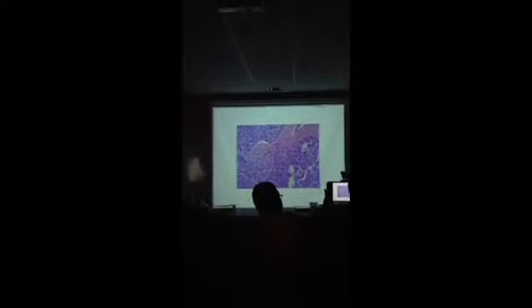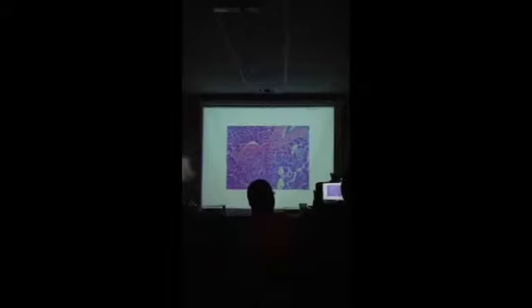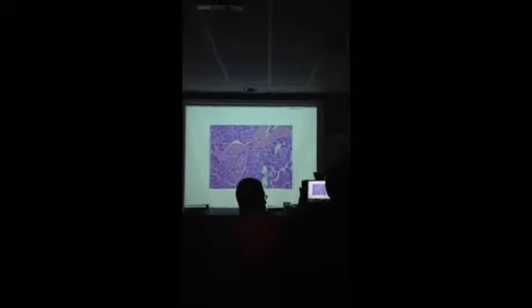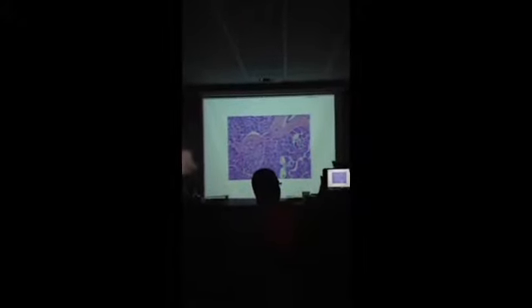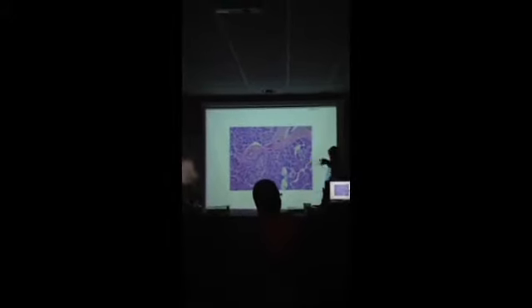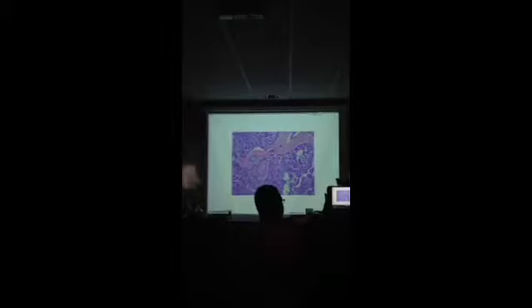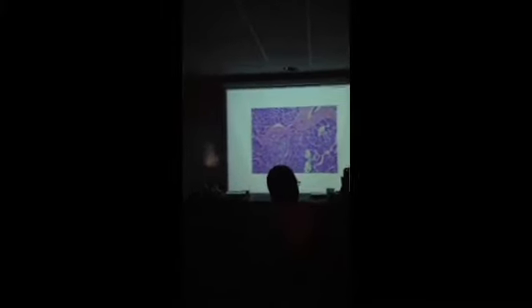Now the pancreas, which is a gland. These are acinar cells. What do they produce? Digestive enzymes. That's the source of digestive enzymes going into where? The small intestine. Okay? Here is a pancreatic duct, and by the way, it's a pancreatic duct that carries secretions. On the models of the pancreas, you can see that white one that runs the length of the pancreas. What do we call that? The main pancreatic duct. And there's one that kind of branched off just before the small intestine. That's the accessory pancreatic duct. And then coming in from the side, all these little ones would be just pancreatic ducts. They bring the secretions in from these cells, mostly digestive enzymes.